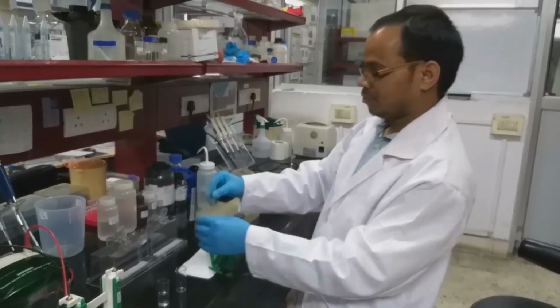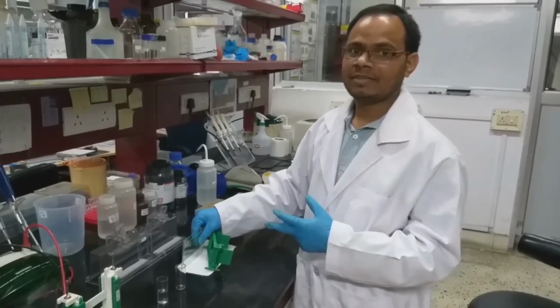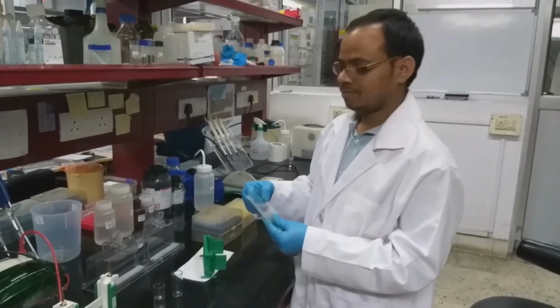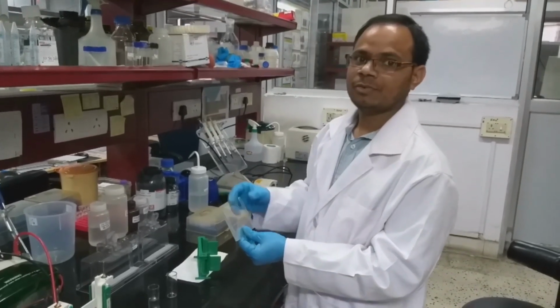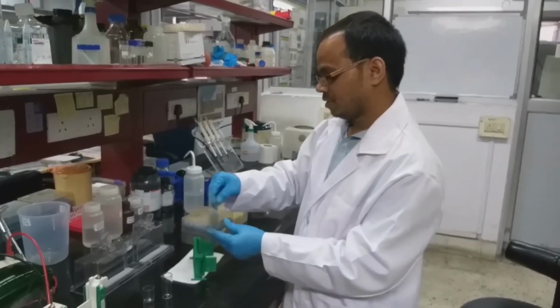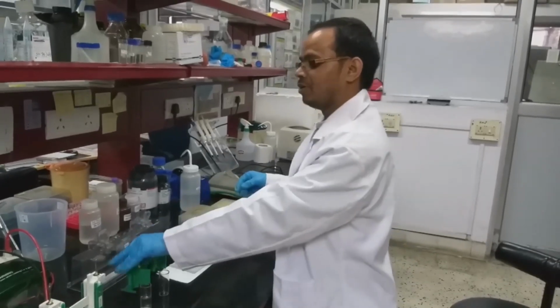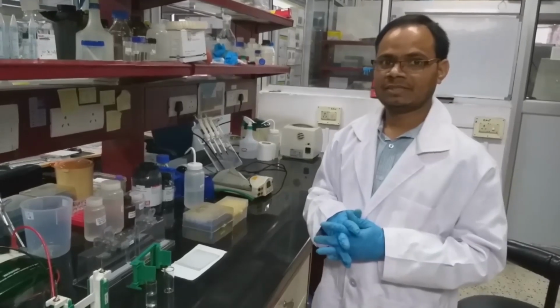Then we'll keep it for some time, at least 20 to 30 minutes, and let it solidify. Then we will prepare the stacking gel. Then we will load our protein solution. So here, before doing that, we need some reagents. So what are those reagents?